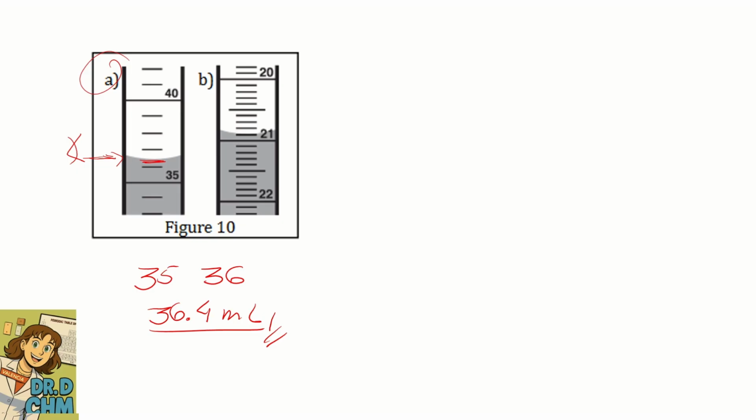In this case over here, look at the volume. It's different. It's not decreasing like this. It's going backward here, right? Most measuring tools tell you how much liquid is inside them, like you see in the first one over here.